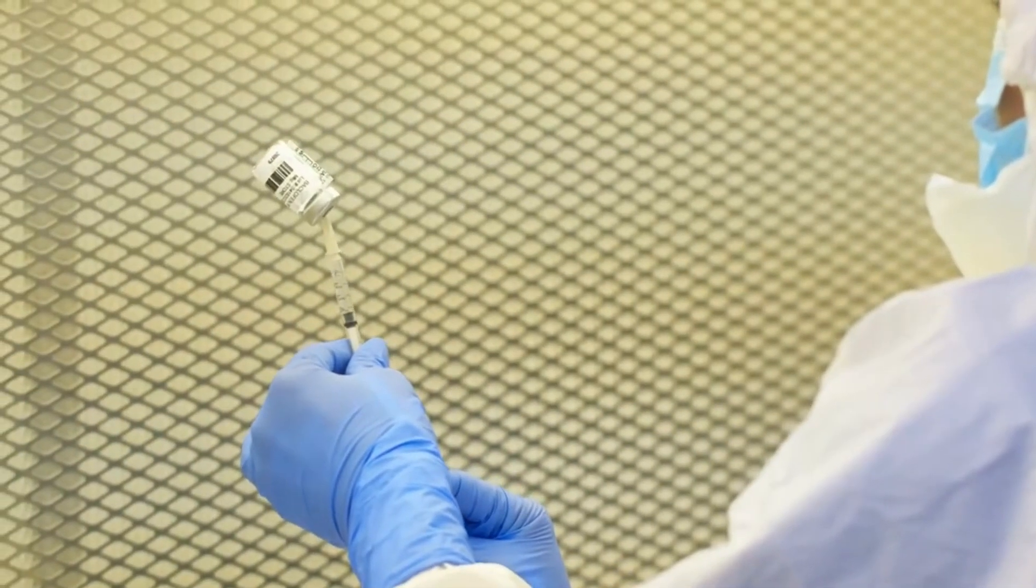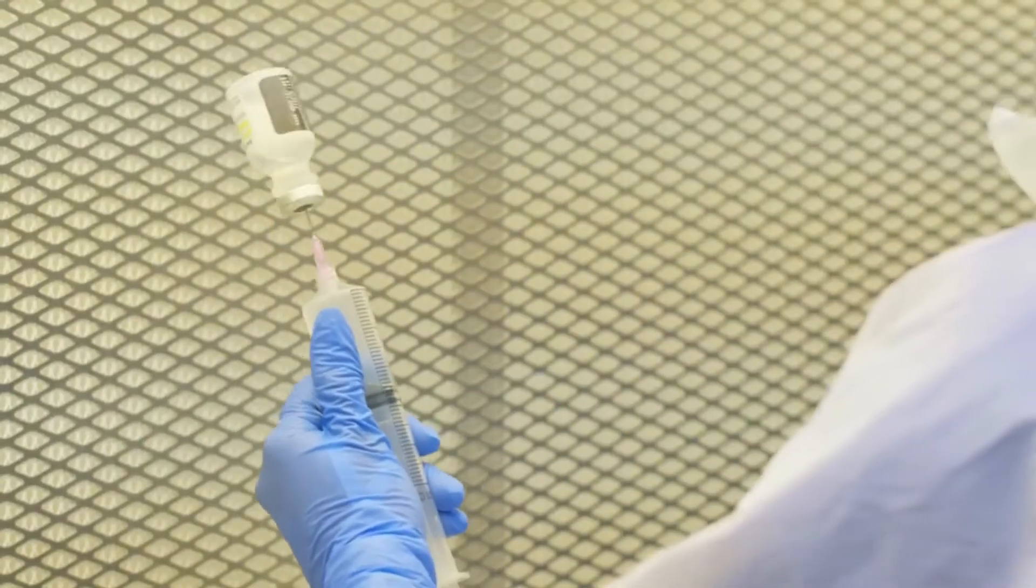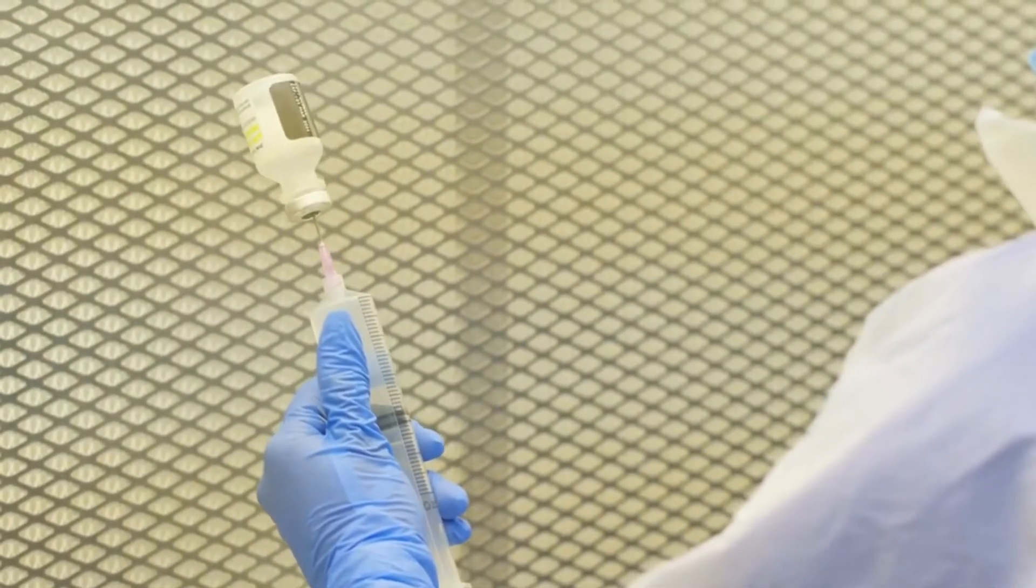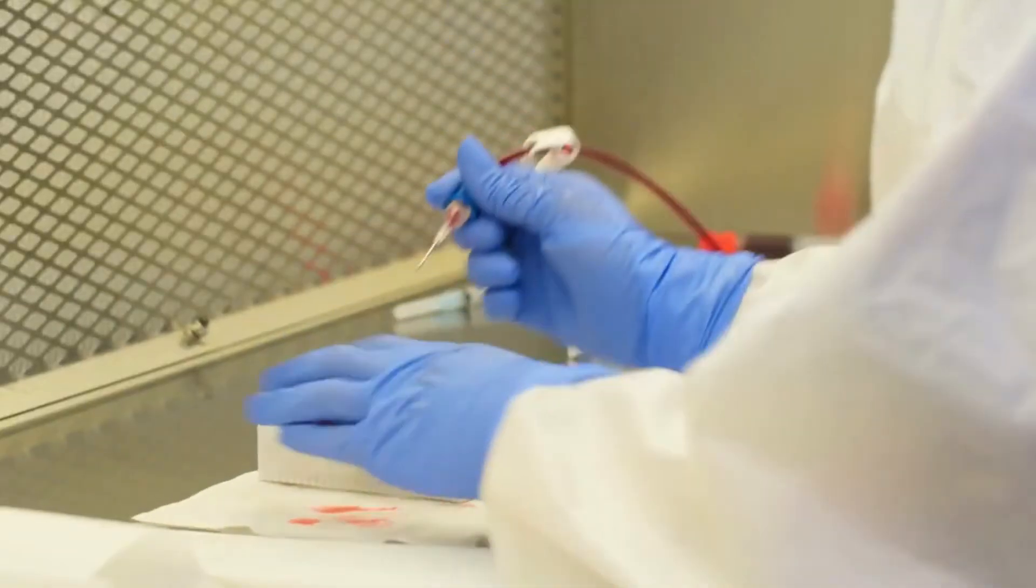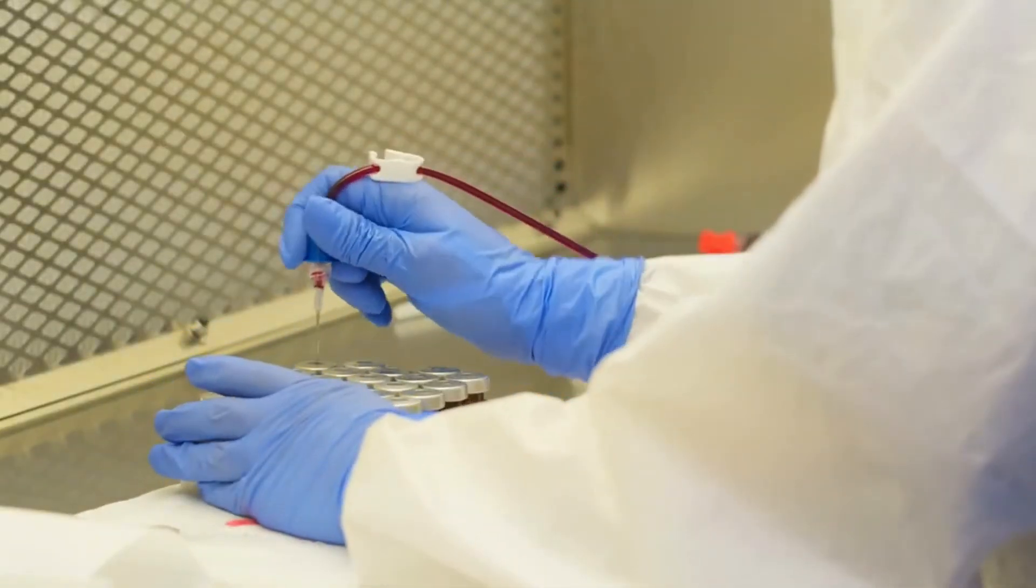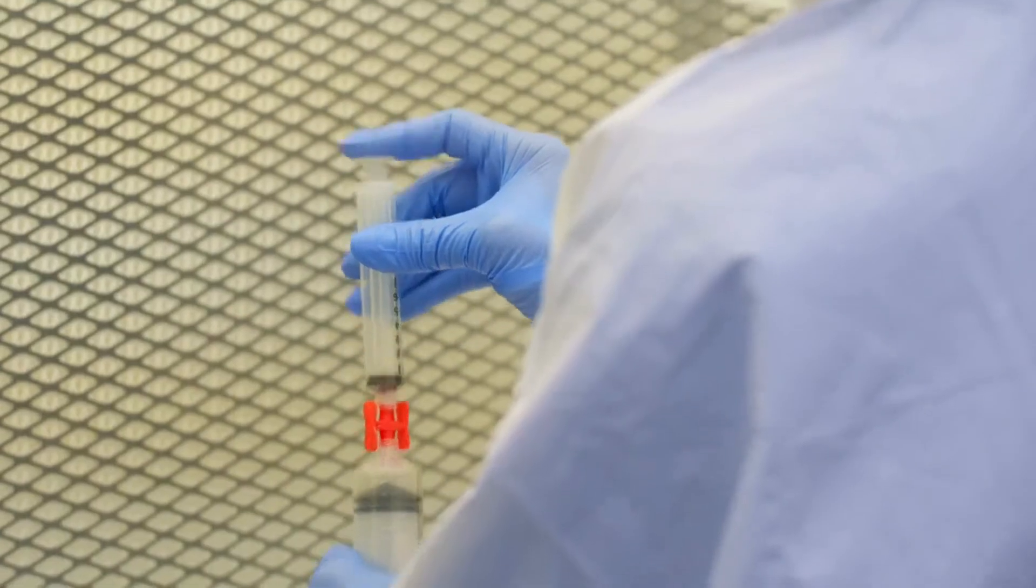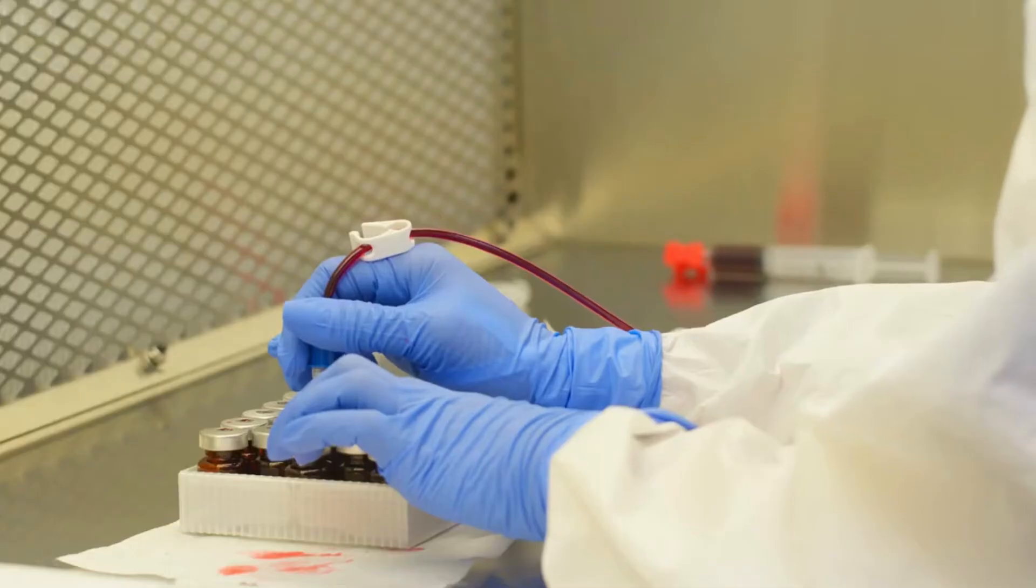We have five clean rooms for sterile compounding. Sterile labs are where we make medications that are injected, infused, or inhaled into the patient's body. When you introduce medication into the bloodstream, cerebrospinal fluid, eyes or lungs, sterility and purity are of the utmost importance, and we take that very seriously.